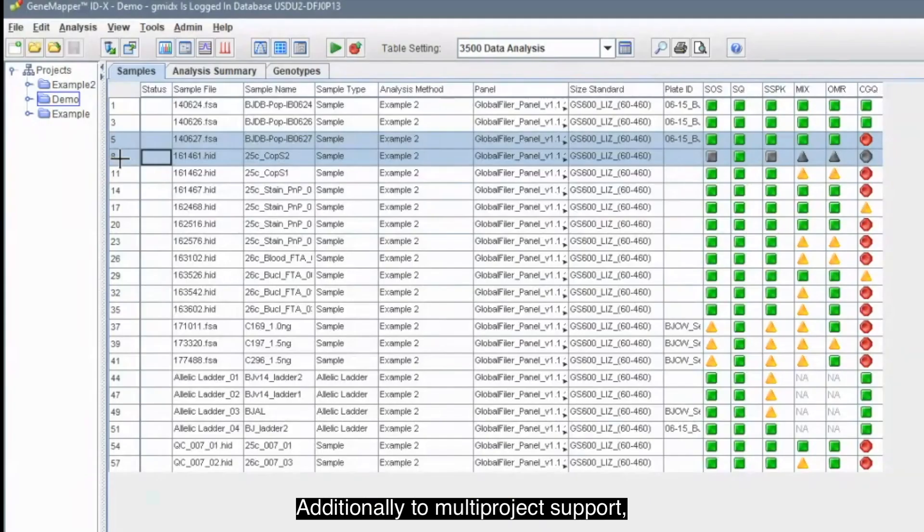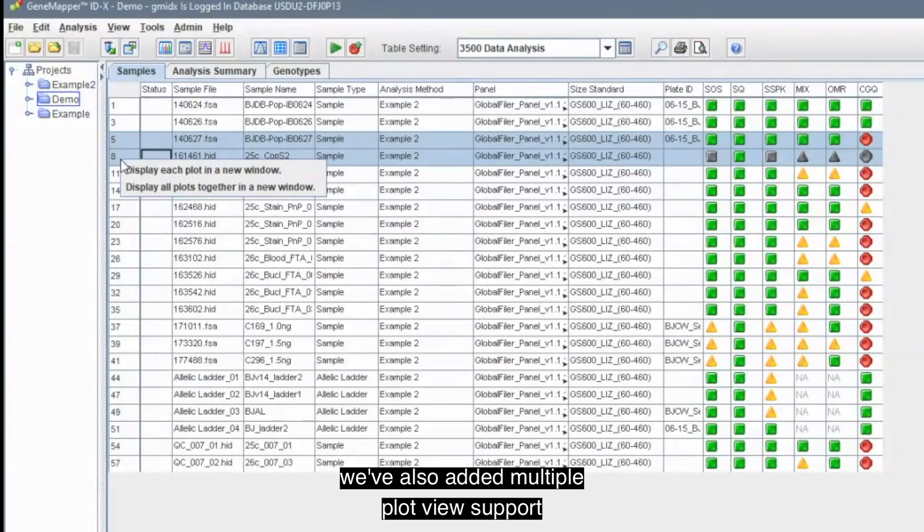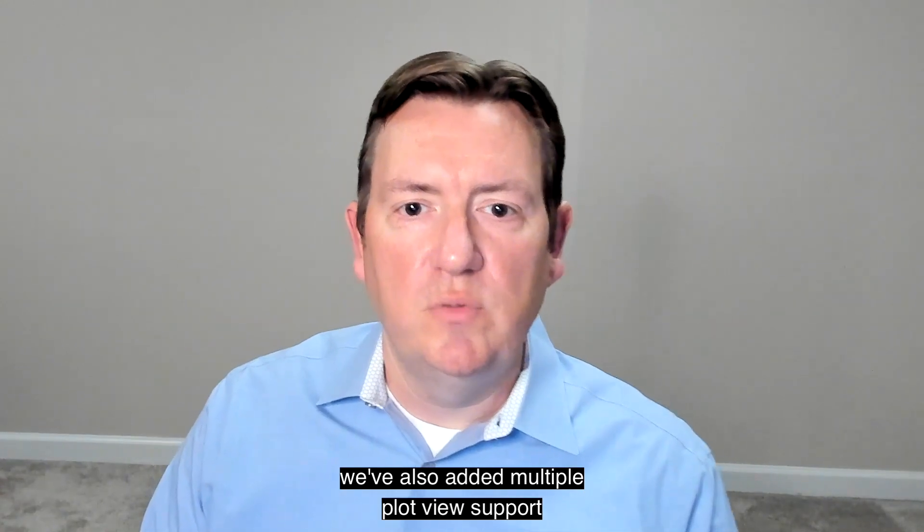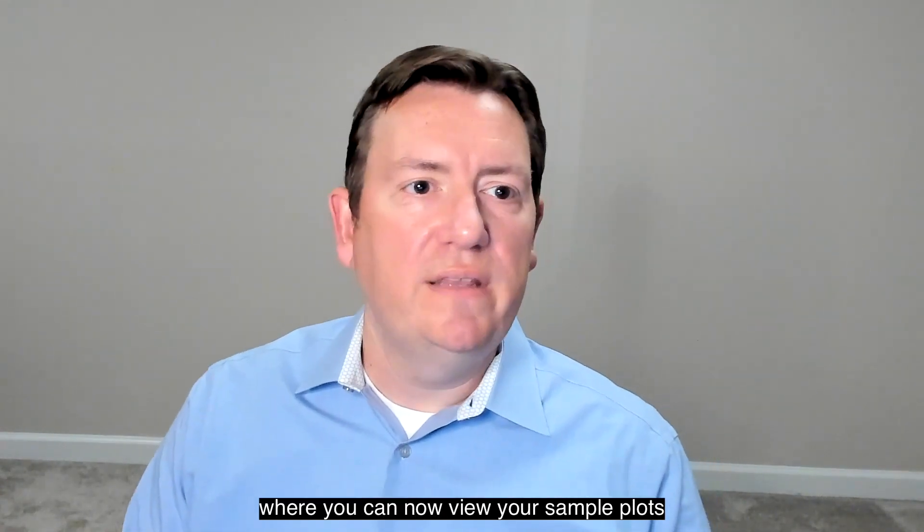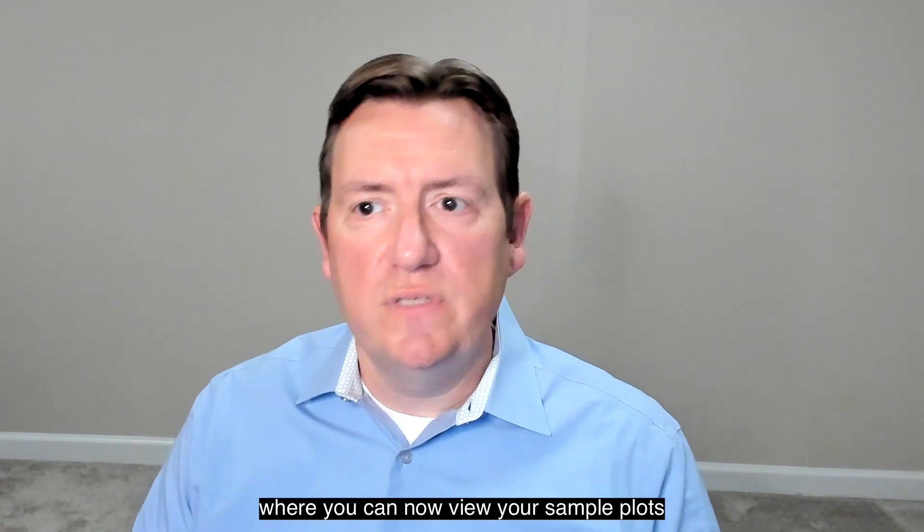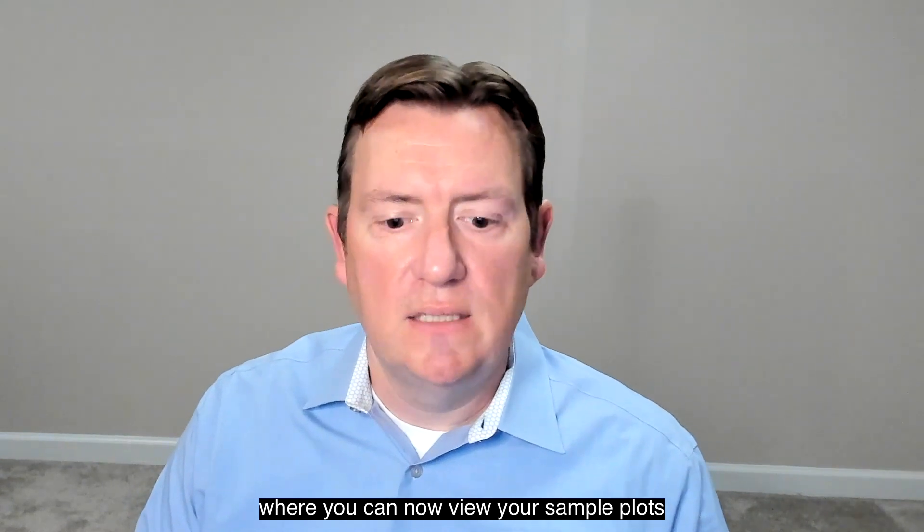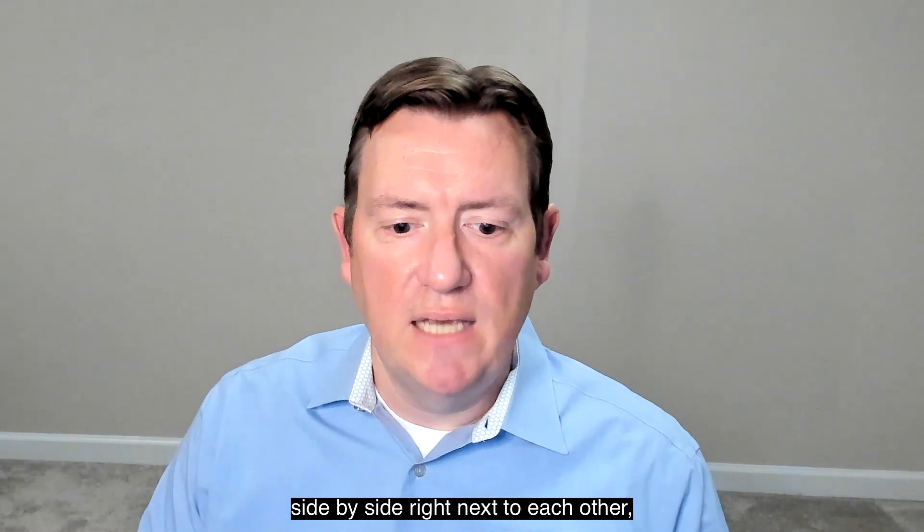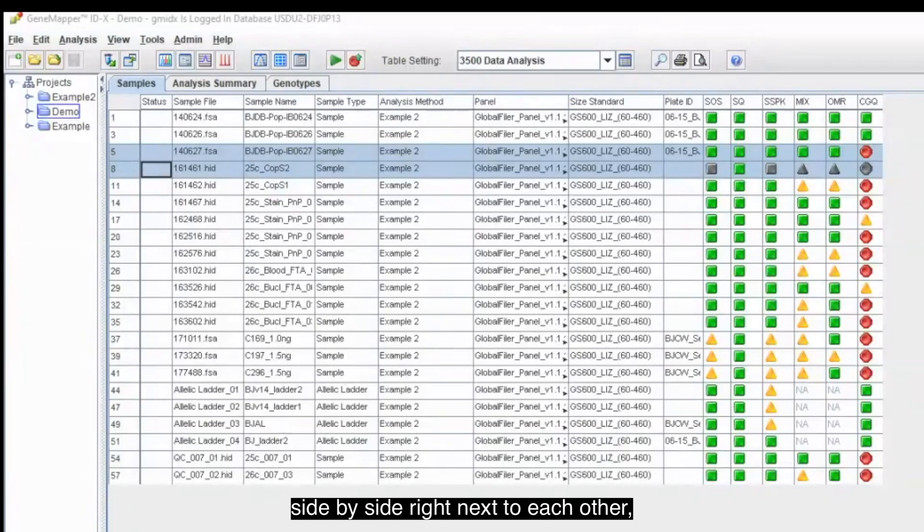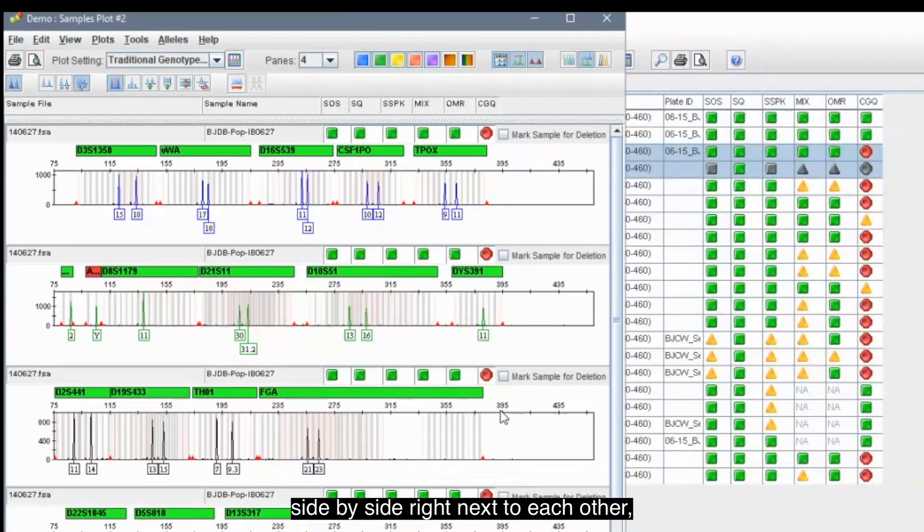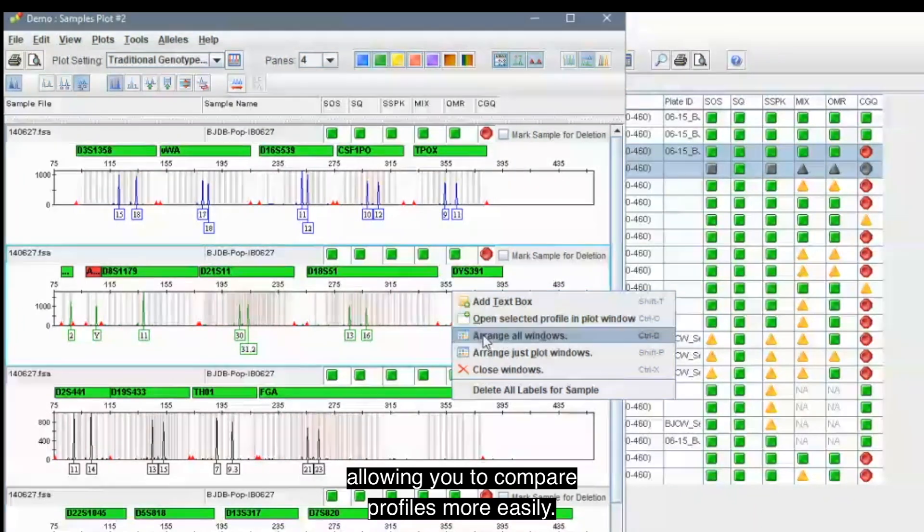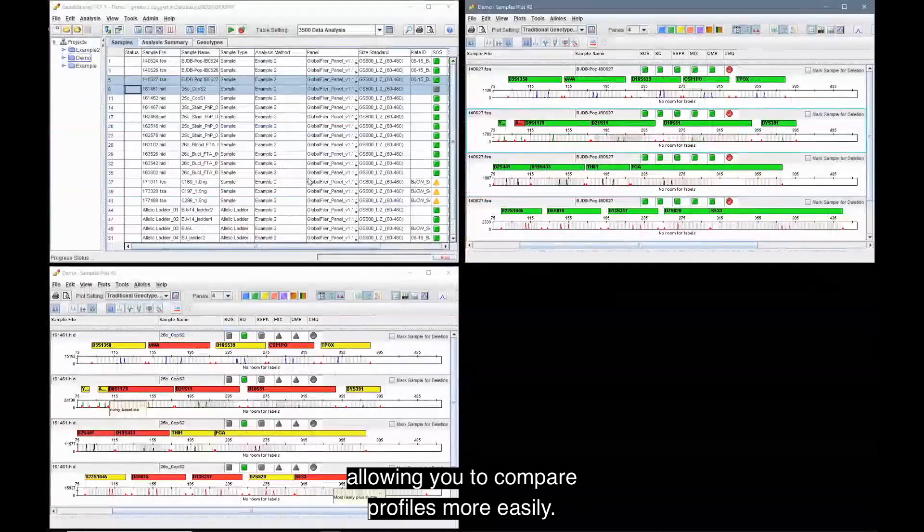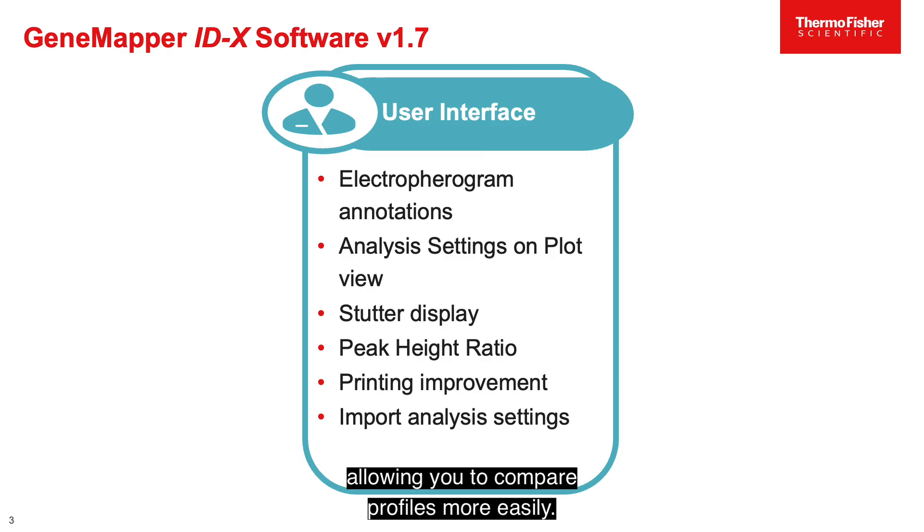Additionally, to multi-project support, we've also added multiple plot view support, where you can now view your sample plots side by side, right next to each other, allowing you to compare profiles more easily.